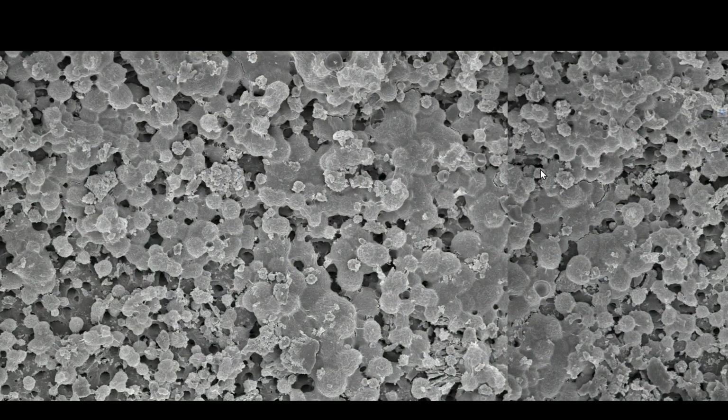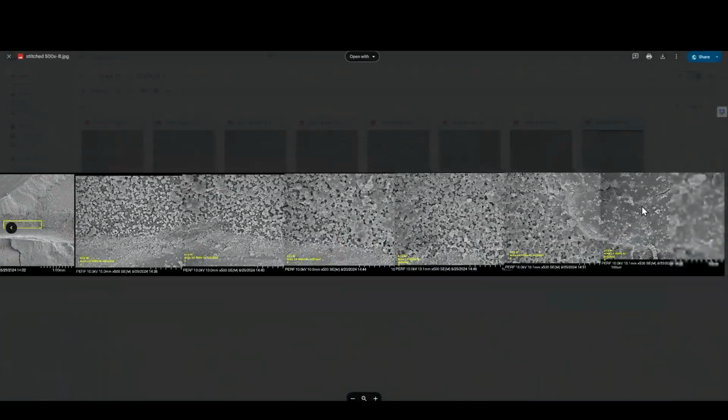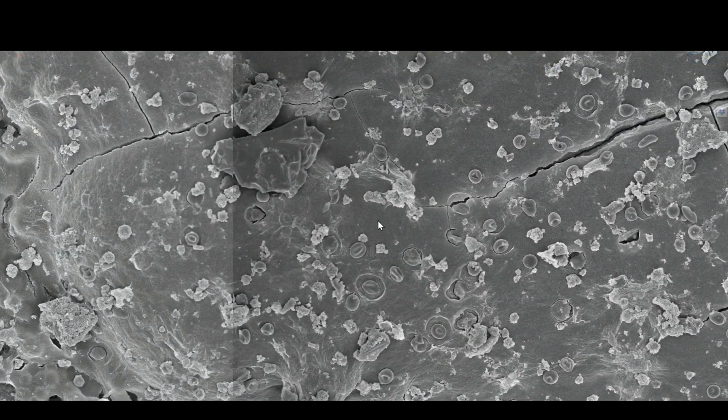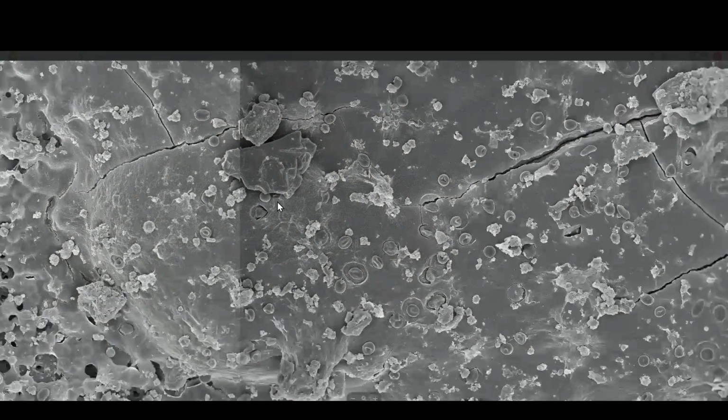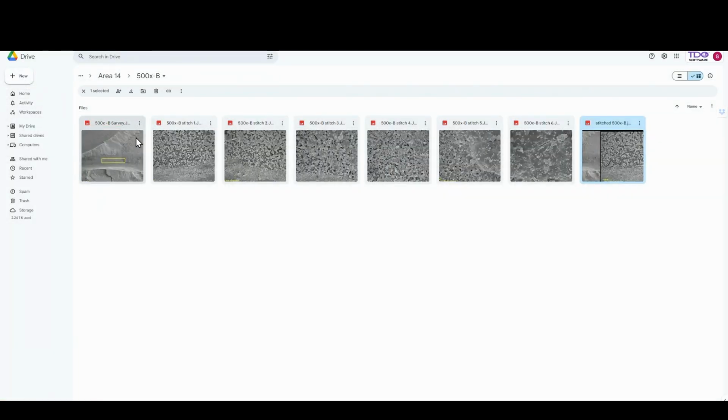Again, in none of these sections do I see any evidence of any bacterial morphotypes at all. This is all just demineralizing predentin and open dentinal tubules, and some predentin that hasn't been demineralized at all. You also see some red blood cells, coagulated red blood cells. So that's area 14. The next sections we'll look at different areas one at a time, and I think that's a better method for us to do this.